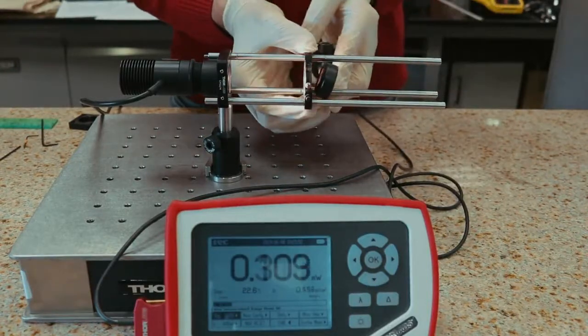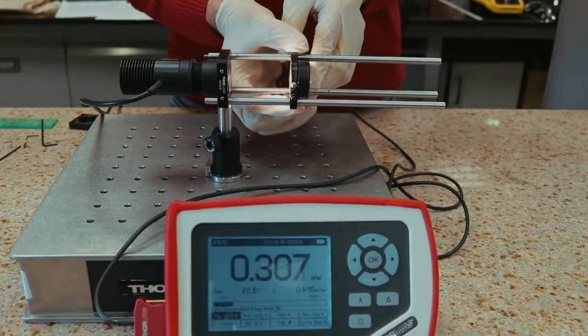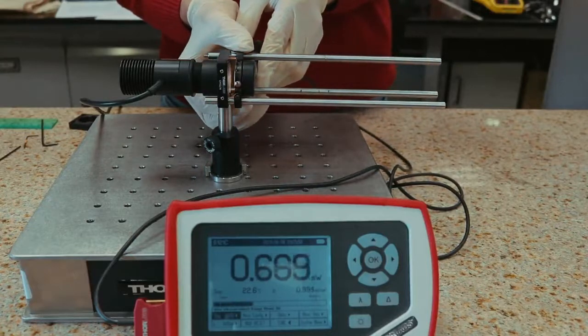With the help of a photodiode power sensor placed on the other side of the aperture, move the iris to the position of maximum intensity.